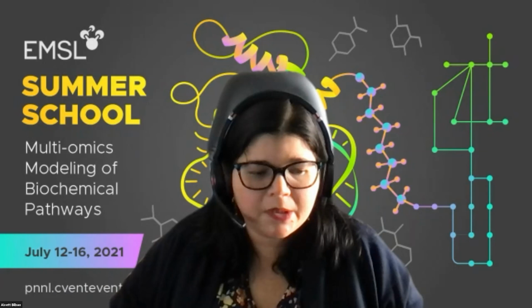Great. Someone also asked about proprietary software, and you mentioned a lot of software tools made in our community that kind of get around that. In the mass spectrometry community in general, they're constantly making tools so that we all can utilize them. And that was one thing for both you and Yu-Chin, trying to show those software tools that can be downloaded and used for lots of different applications.